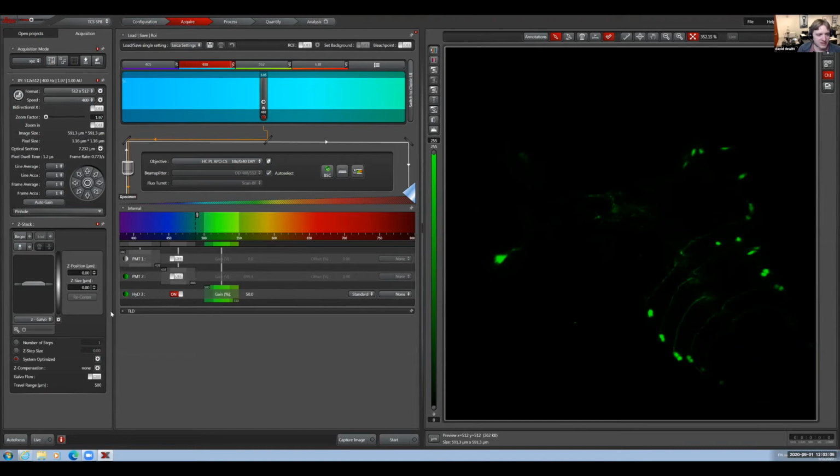And as we were going down, so let's go live one more time here, and I'll let you drive for a second. And under that zoom factor slider in the software, I'd actually click live first. Is it live? It's live. Okay, so that zoom in button, yep. Click on that, and then draw a box on the image around what you want to zoom in on.